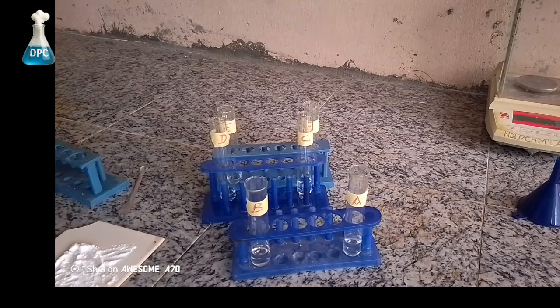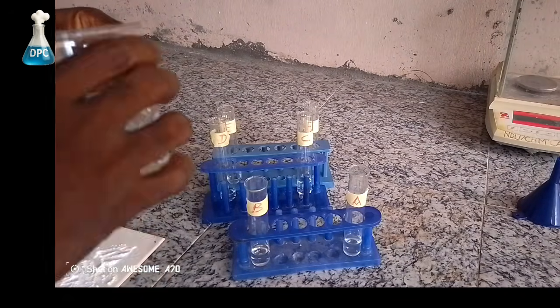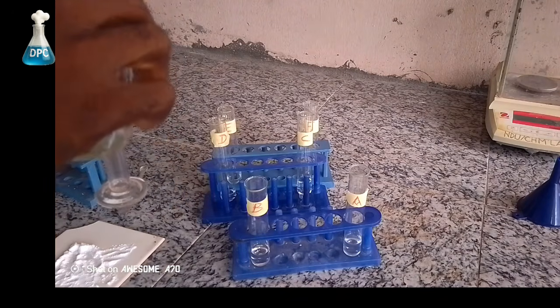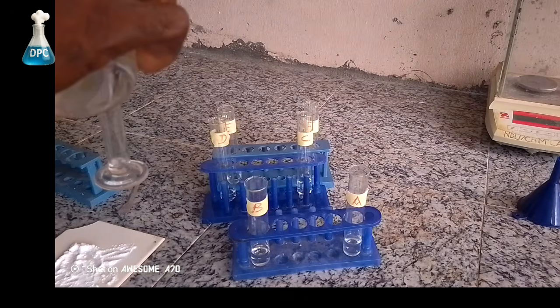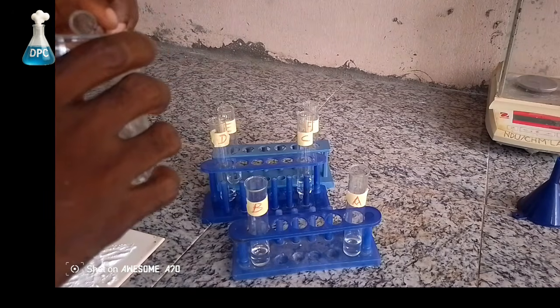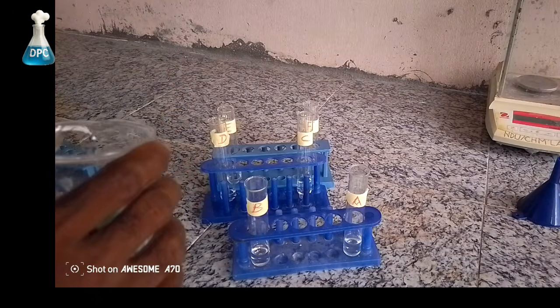The next thing to do is now to add water to make each of them 10 ml. Now test tube D, which has 5 ml of the acid, we can now add 5 ml of water to make it 10 ml solution.